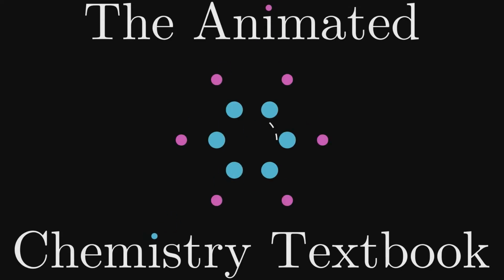Welcome, fellow chemists, to the first video in the series on instrumental analysis. Today we will begin our journey with mass spectrometry.